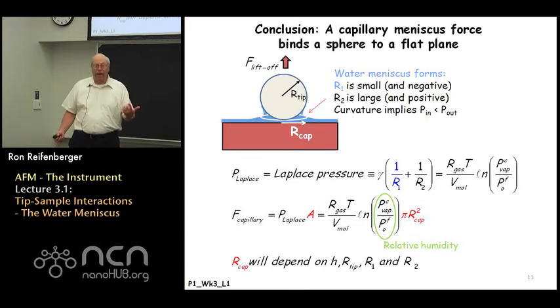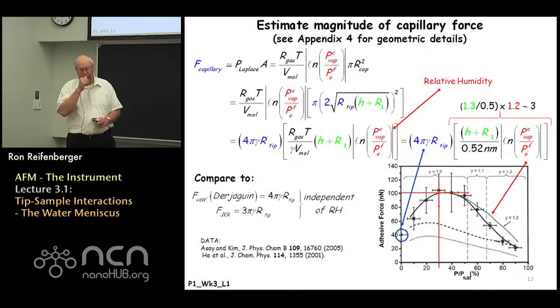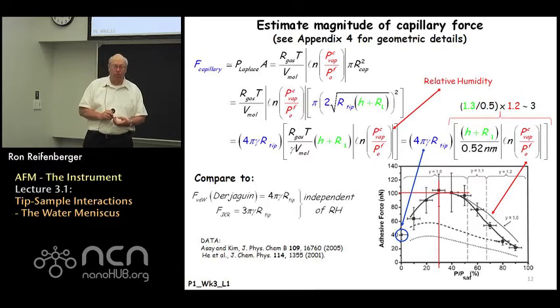The thing you have to recognize is that this radius r cap will depend on all the parameters in the problem. It'll depend on the thickness of the water layer H, on the radius of the tip, and on the radii of curvature R1 and R2 that characterize the liquid trapped between the tip and the substrate. In the next slide, I try to estimate the magnitude of this capillary force.